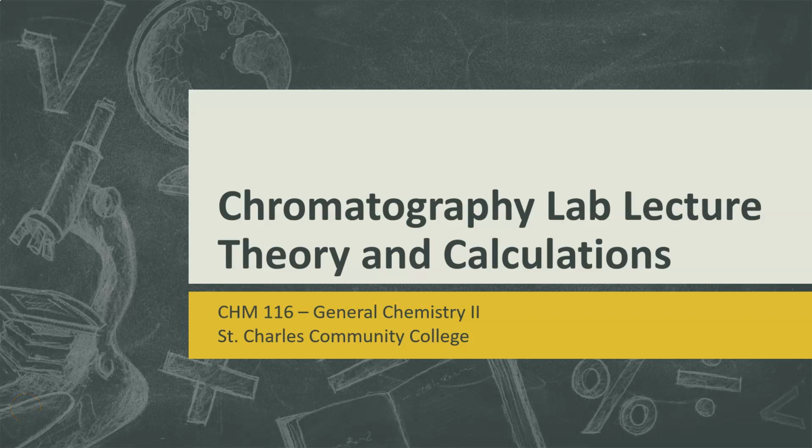This is the lab lecture video for the General Chemistry 2 lab chromatography. This lab lecture video is going to be focused on the theory, like what is chromatography, how does that relate to things we've talked about in lecture, and the calculations that go with it. The lab lecture video about the procedure is a completely separate video. So this one is focused on the theory and calculations. There is a second video focused on the procedure.